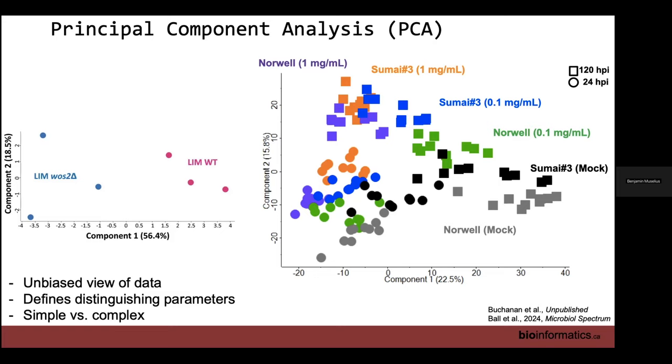And this is actually from plant data, which are notoriously challenging. It's a really nice data set. So that's why I put the PCA up there. But you do need to look into it. You need to see what the components driving these visualizations are.